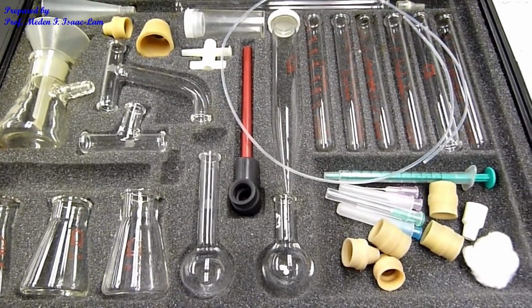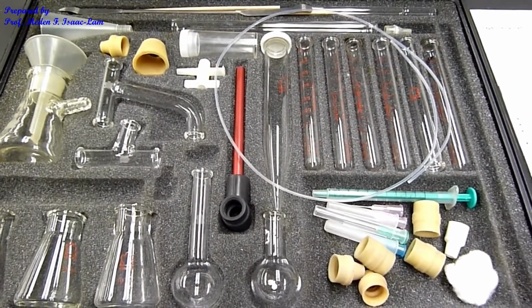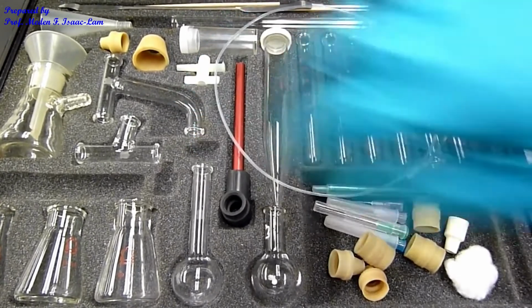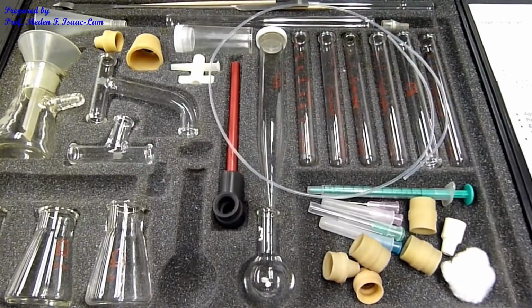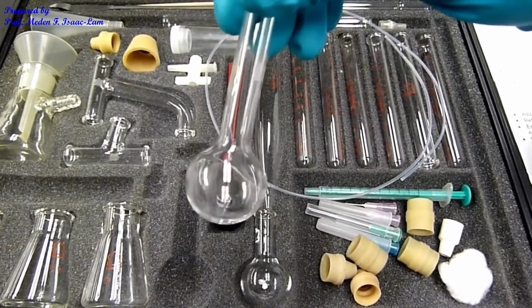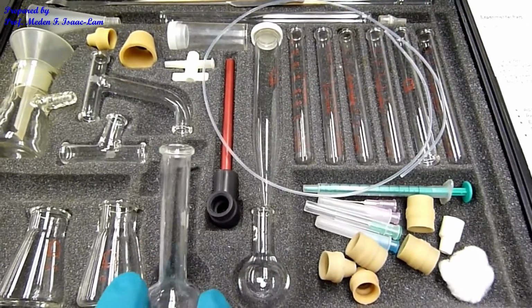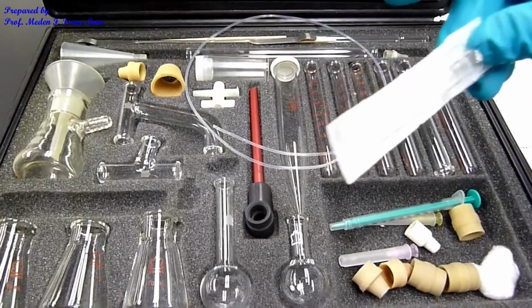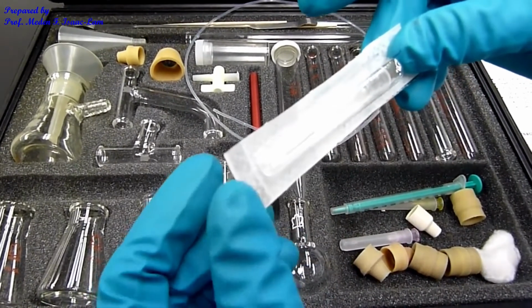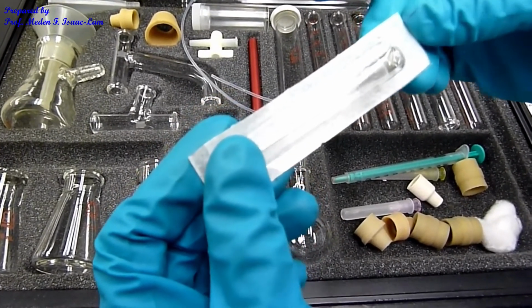This is now the microkit, and I will now set up the experiment. I will assemble the setup using the long-neck round bottom flask, and then I'm going to use the adapter. I will now assemble the trap for the HBr, the gas that is generated during the reaction.